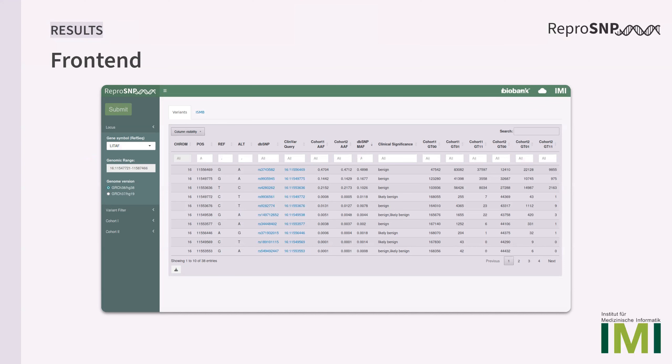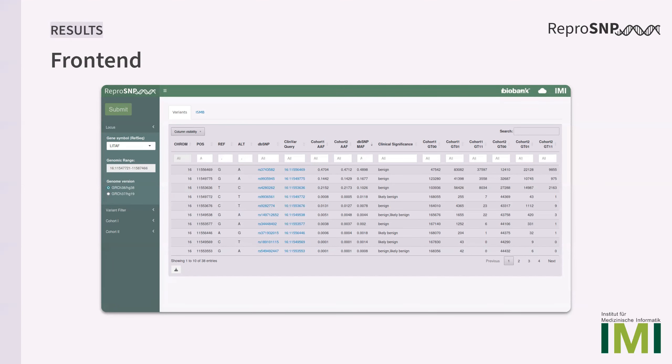The main panel consists of the resulting variants within the genomic range in the two cohorts. The variants are annotated to RSIDs, which are linked to the matching database entry in dbSNP. There's also the option to search for this variant in the ClinVar database and the potential clinical significance is also annotated and displayed in the table. Then we see three different allele frequencies, one in the first cohort, another one in the second cohort, and then also the respective allele frequency from the dbSNP database. The table also contains information about the genotype counts in the two cohorts.